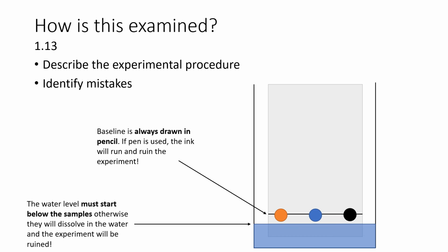Okay. The second mistake that you should always notice, and in any of these questions you'll find, is that the water level must be below the samples. Otherwise they'll dissolve in the water before the experiment begins. This works both with you being asked to describe or draw the chromatography setup, as well as commenting on a setup given by the examiners.